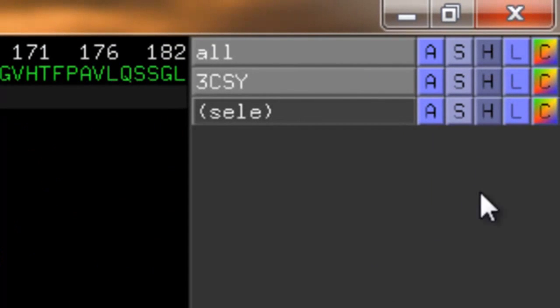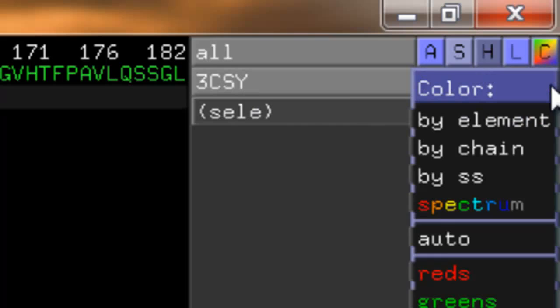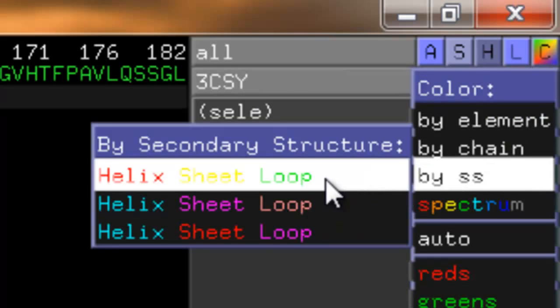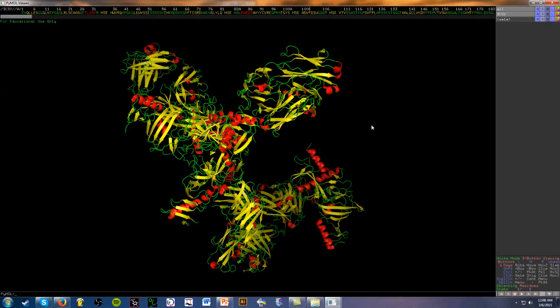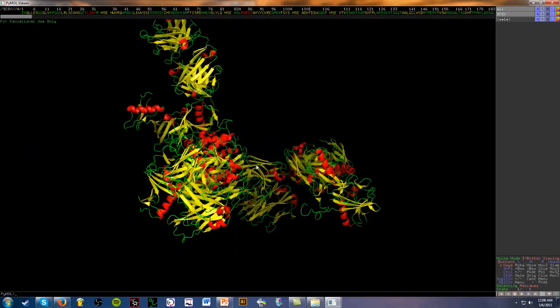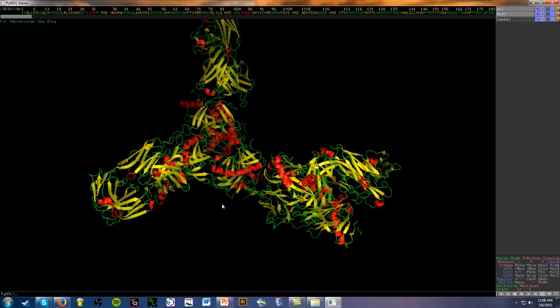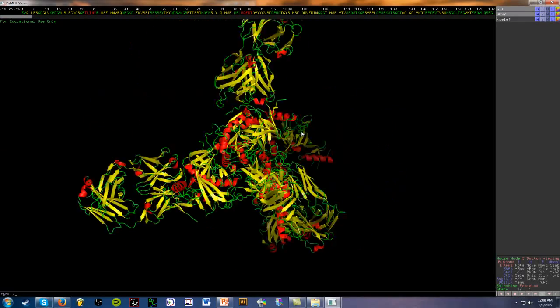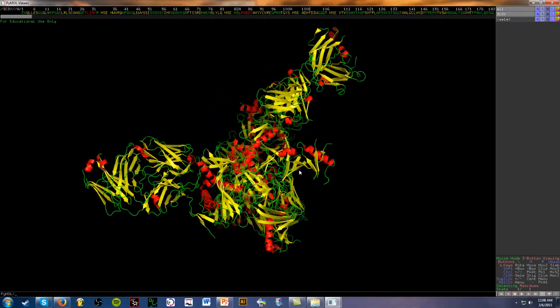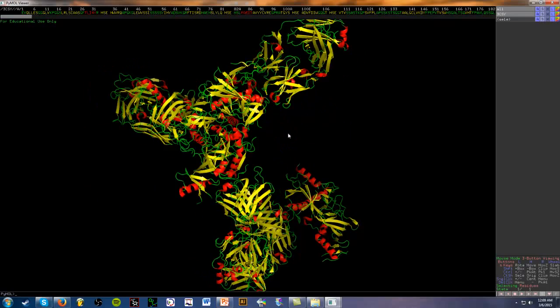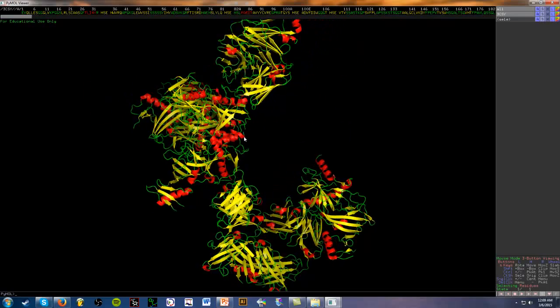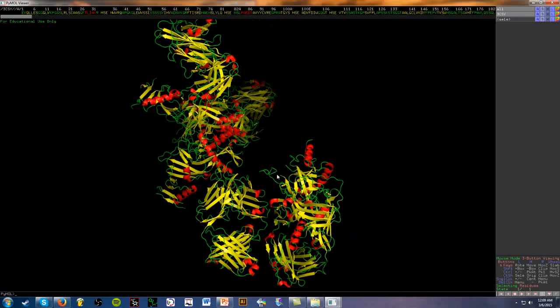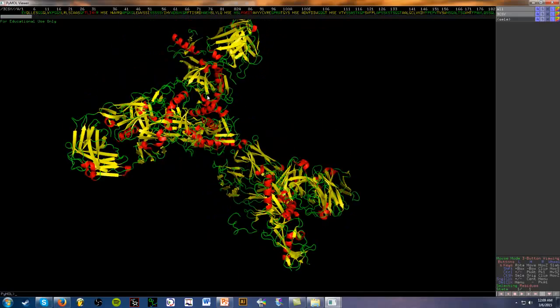So now we see this cartoon structure showing different secondary structures. Let's make this a bit more clear. We're going to go to the structure here, 3CSY, go to C for color and we're going to color by secondary structure. This is good. So now what we see here is that the alpha helices are in red, the beta sheets are in yellow, and the loops and turns are in green.